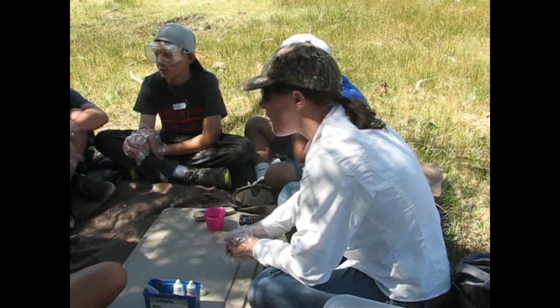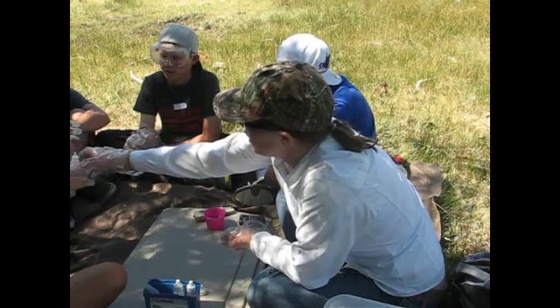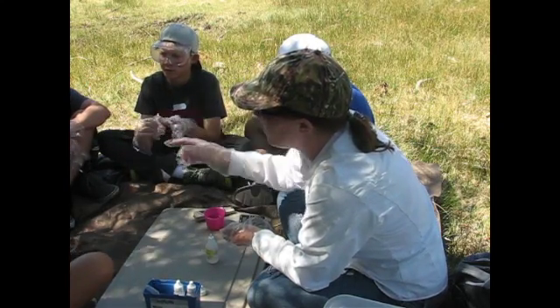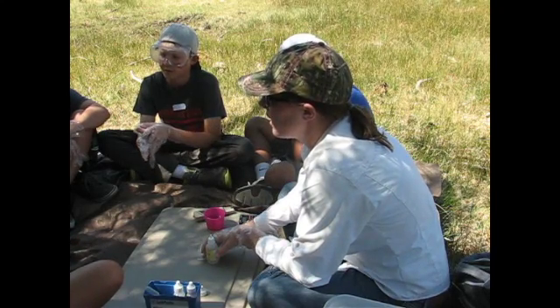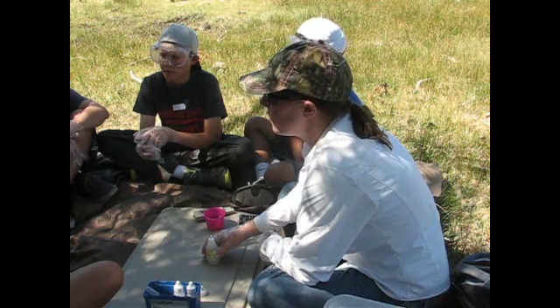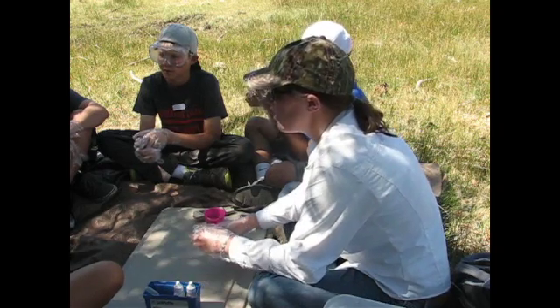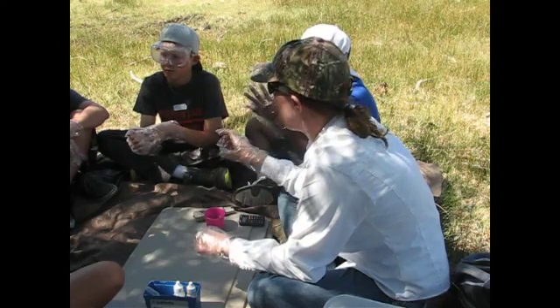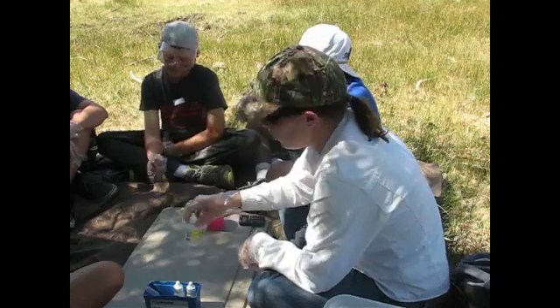Just one drop, and then put it down. Okay, so put the lid on. She did 2 drops. Okay, so mix it up. Okay, so it took purple 2 drops. Usually you do 1 drop at a time, and then you mix it up, and then you pass it. Now it's blue. So it took 2 drops to make it blue.